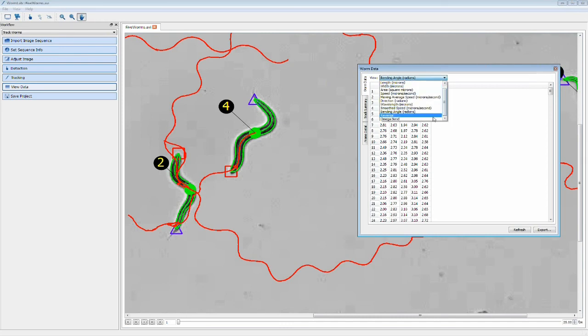And then finally, we have two more here. I'll just talk about these briefly, and we'll show you these in some subsequent slides. We detect the reversal behavior and also the omega bend. So we'll mark each worm with the word reversal if we're detecting that it's actually moving backward, which is defined as the distance or the direction opposite to where its head is pointing. So having the head position marked correctly is important, and we showed you that that's automatically corrected while we track anyway.